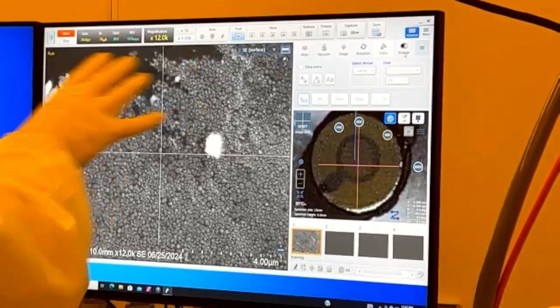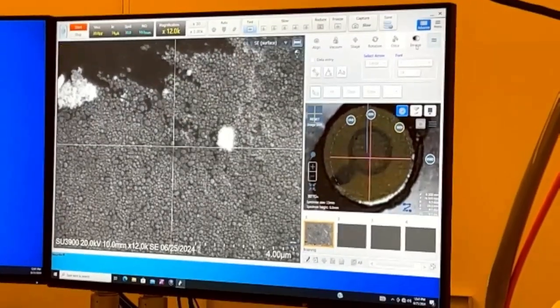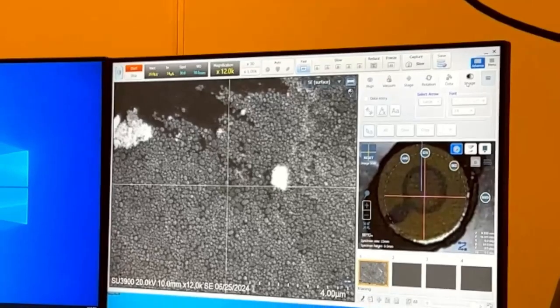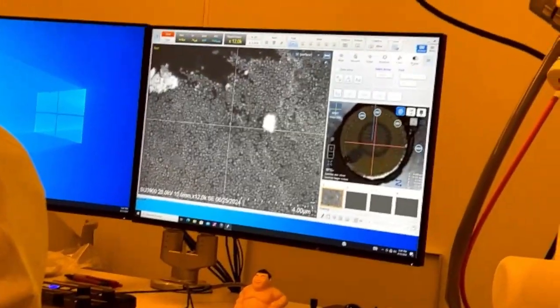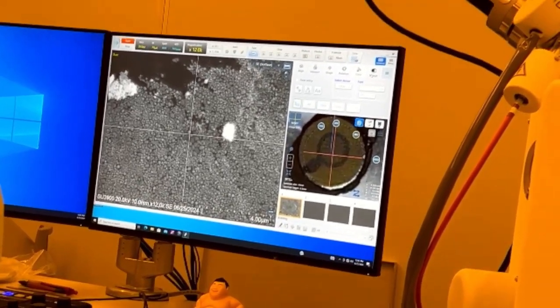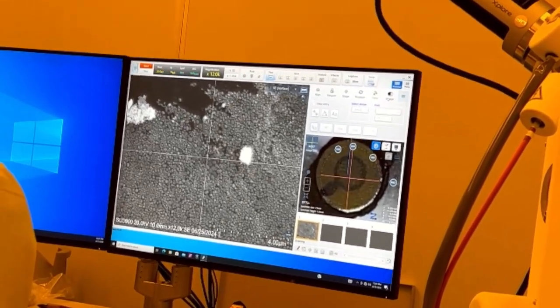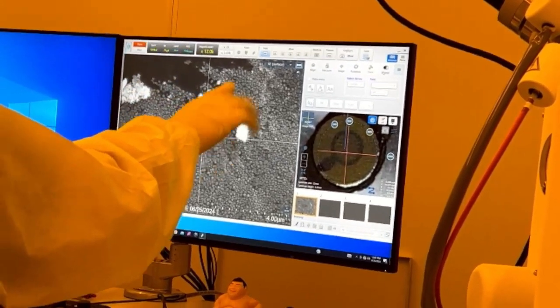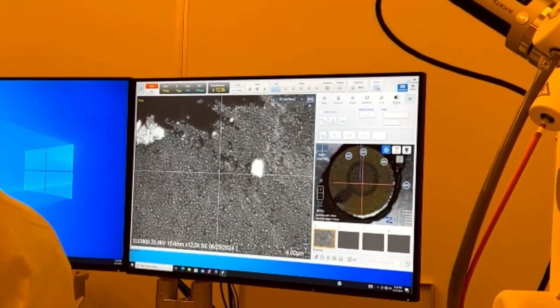You can also do this afterwards. There's software in here that you can do this. You can do measurements, post-processing after the fact as well. So, can we save the images after the measurement? Yes, you can save images after the measurement, but by doing that, it's going to be burned into that image. So if you're fine with it being permanent, yes. Whatever I have put on here before I capture will be in that image permanently.